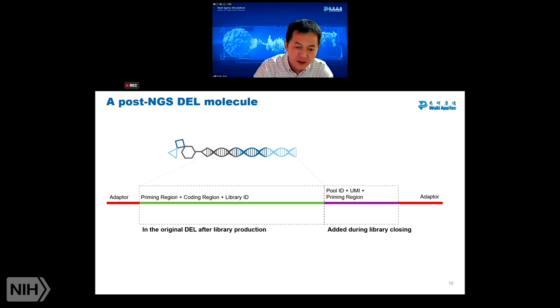There are different implementations of this, and there are additional accessory sequences people put in, such as an anchoring sequence to fight against frame shift, and other sequences you can use to detect mutations in the PCR.